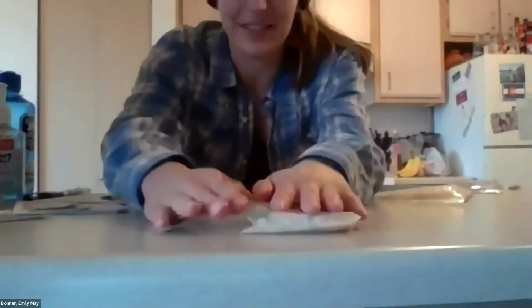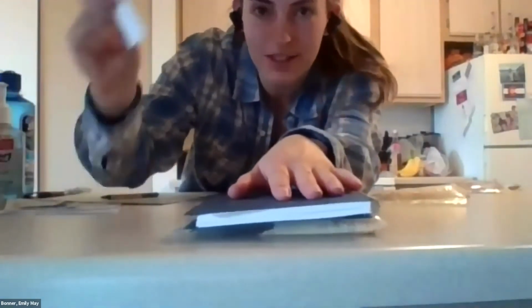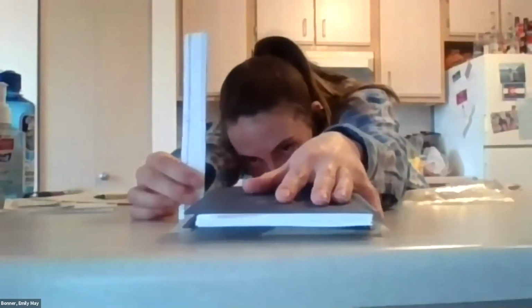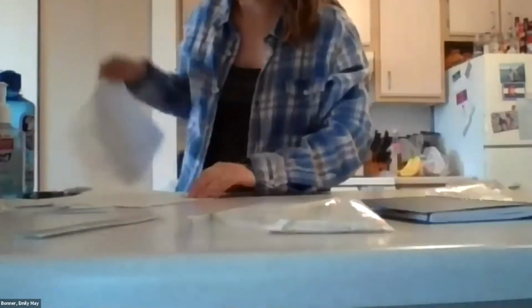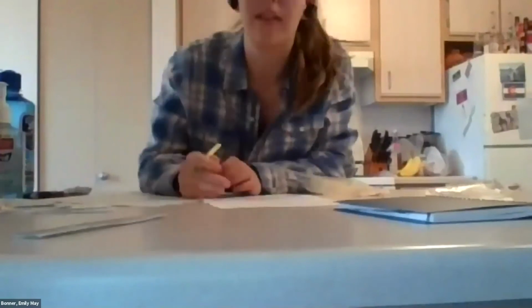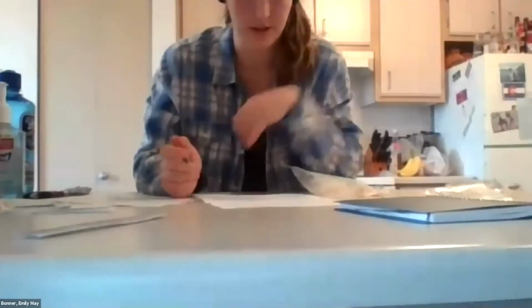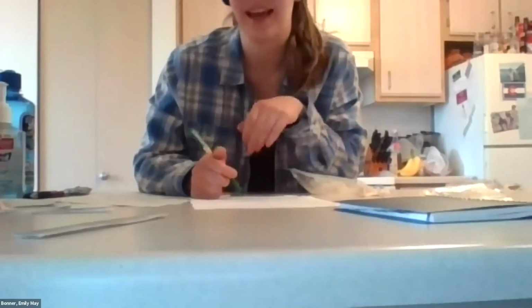Okay, so I have my baggie. I'm either leveling it out with my hand or some kind of flat object to try to get the bag nice and even. And then I'm using the centimeters on my ruler to just measure the height of the bag, so the highest point of the bag. Okay, and then once you measure that, you just want to write it down in your table on the worksheet. And then you'll do that for each of your baggies. So we should have a height for the control, a height for the low dose, a height for the medium dose, and a height for the high dose. Okay, I'm going to move my computer back.